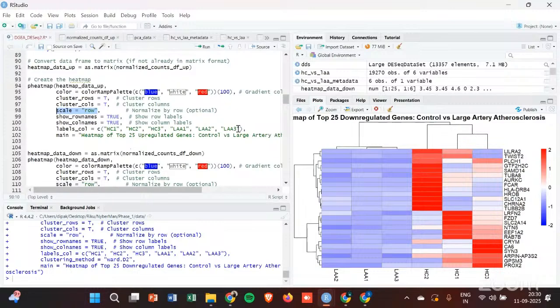People are of the opinion that such huge fold changes should not happen in a biological system that is so tightly regulated. You can have differences, but you should not have such high differences. That is the reason why people go with shrinkage. And in that case, if you are doing it with DESeq2 and doing shrinkage, you should report both. You should also report that you lost this many genes to the shrinkage, and these are the ones that were left. Thank you so much. You're welcome.